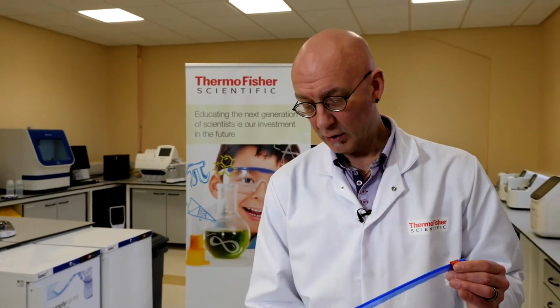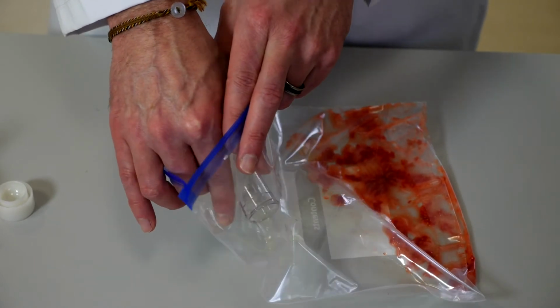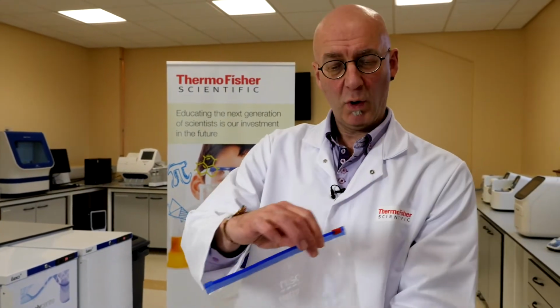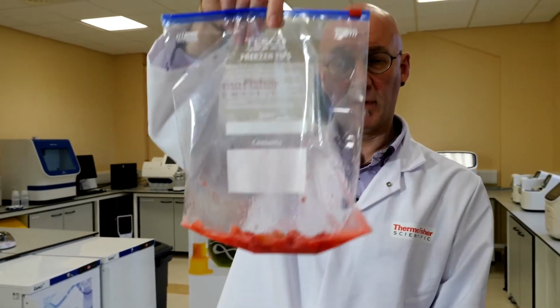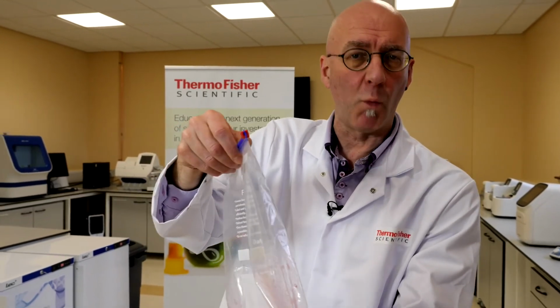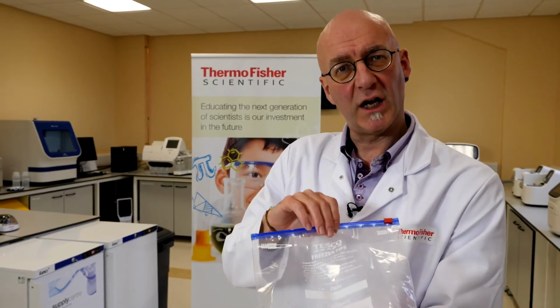We're now going to add the contents of this to our bag. So unzip the bag, open the bag, take your extraction buffer and pour into the bag. Remember, zip that bag back up. What we're going to do now is massage this very gently. We don't need to really bash this around. That's what you end up with. You end up with some liquid, you end up with our strawberry gunk, if you like, the cell wall debris, but we have a solution. And the solution that's surrounding the cell debris and the strawberry debris will contain our DNA.